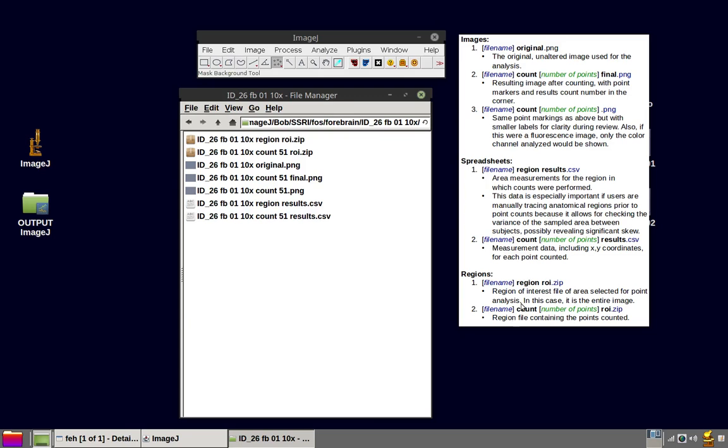And finally, two regions are created. The aforementioned region results, which is the selection in which the point counts were made. Not only are the measurements for that region saved, but the region itself is saved. In this case, our region.roi is simply a rectangle of the entire image.